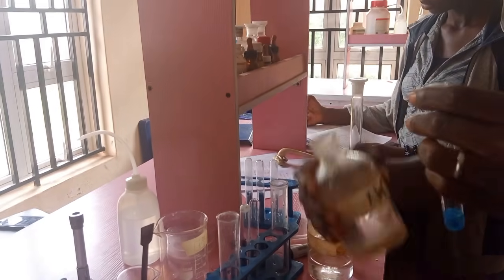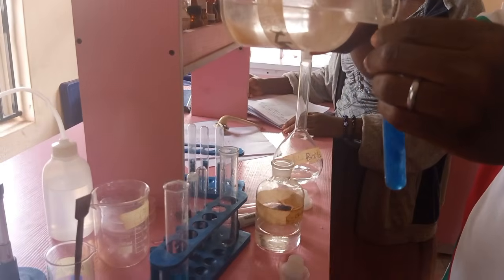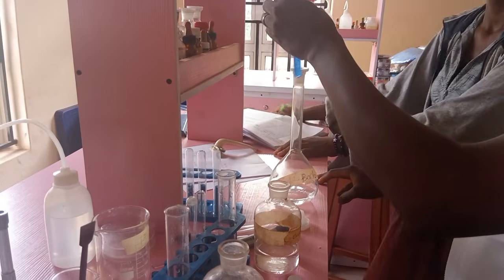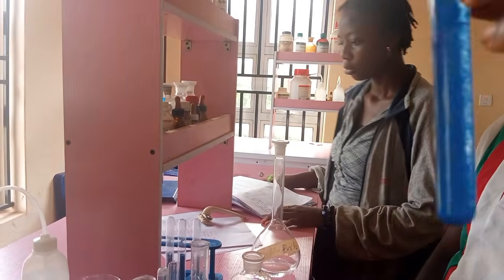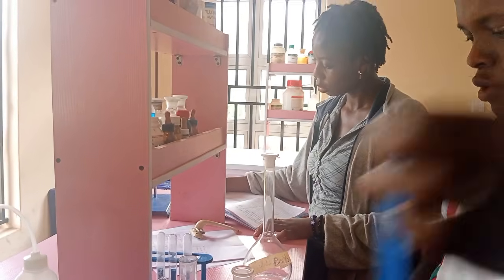Now let's add in excess and see what will happen. What remains? The precipitate is insoluble. A pale blue precipitate forms, and the precipitate remains insoluble.